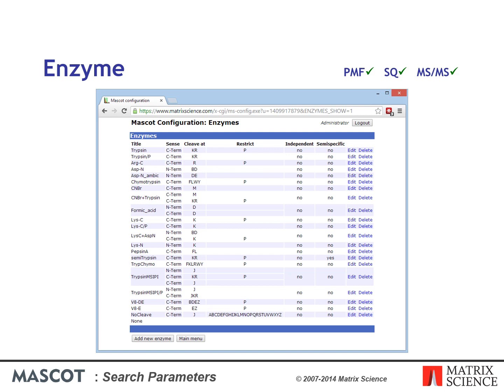The second category simulates a single sample aliquot being digested simultaneously or serially by more than one cleavage agent, for example CNBr followed by trypsin. Remember that enzyme type none simulates cleavage at every peptide bond. For top-down searches where you don't want any cleavage, choose no cleave.